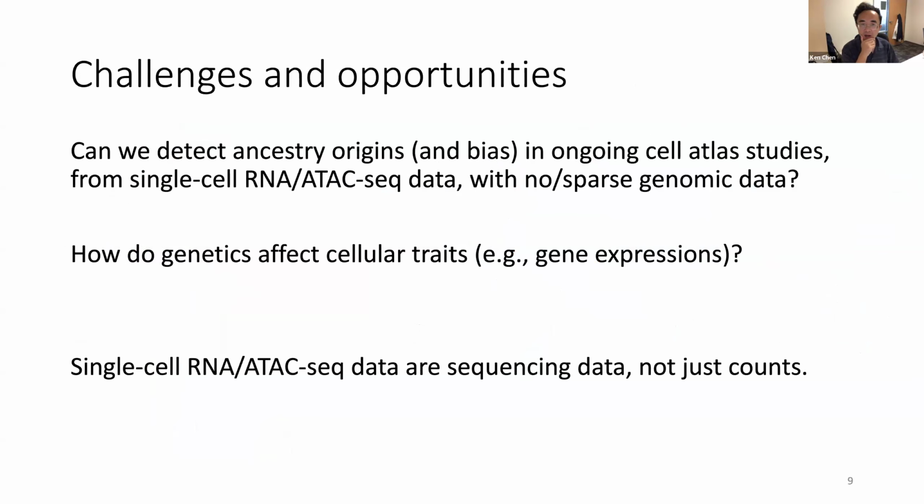That's why the Chan Zuckerberg Initiative, which is driving the Human Cell Atlas, approached us. They wanted us to develop a tool that can call SNPs and mutations from single-cell RNA-seq data, which are the main transcriptomic reference data sources, so we can at least characterize the ancestral origin of those samples and tell if there's a bias in the sampling process.